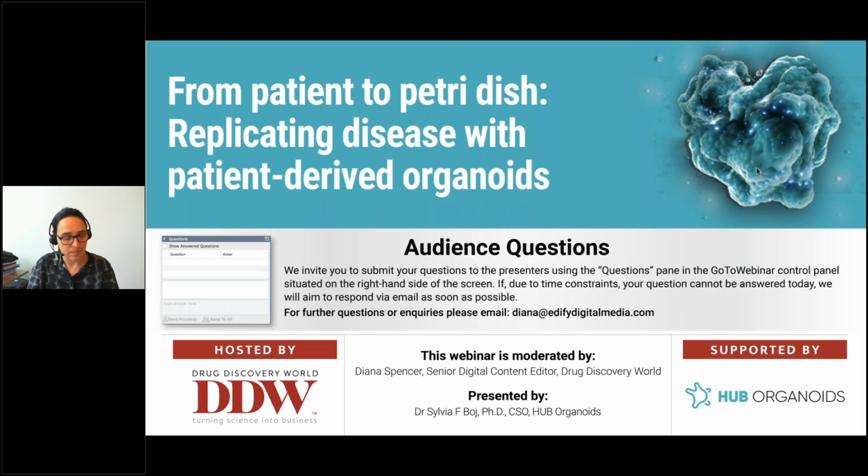Brilliant, thank you. Do you think the organoid fibroblast co-culture model fits better for evaluating targets in epithelial cells or fibroblasts? Well, I think that of course it is a platform that allows testing any compound that is aimed to integrate the crosstalk between the epithelium and the fibroblast, right?